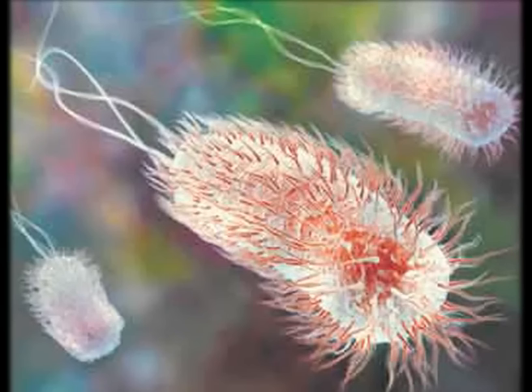This kind of media is used in studying bacterial motility, as there are certain groups of bacteria which move with the help of flagella. This kind of medium can be used to study bacterial flagellar movements. For example, certain transport media like Stuart and Amies medium are also semi-solid in nature.